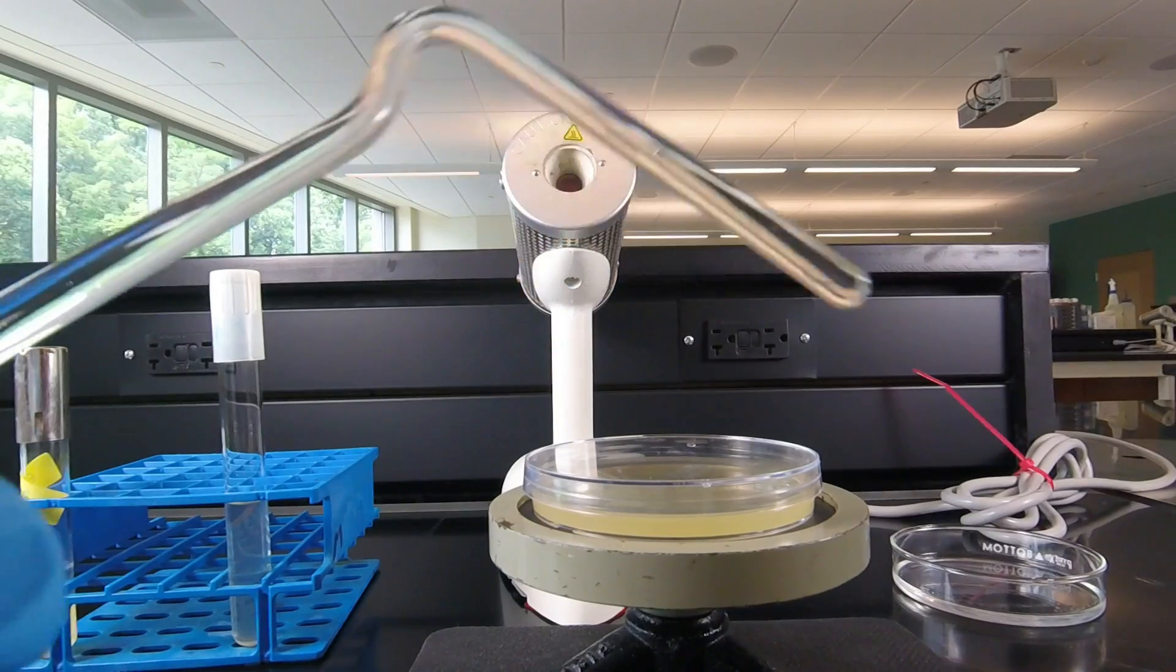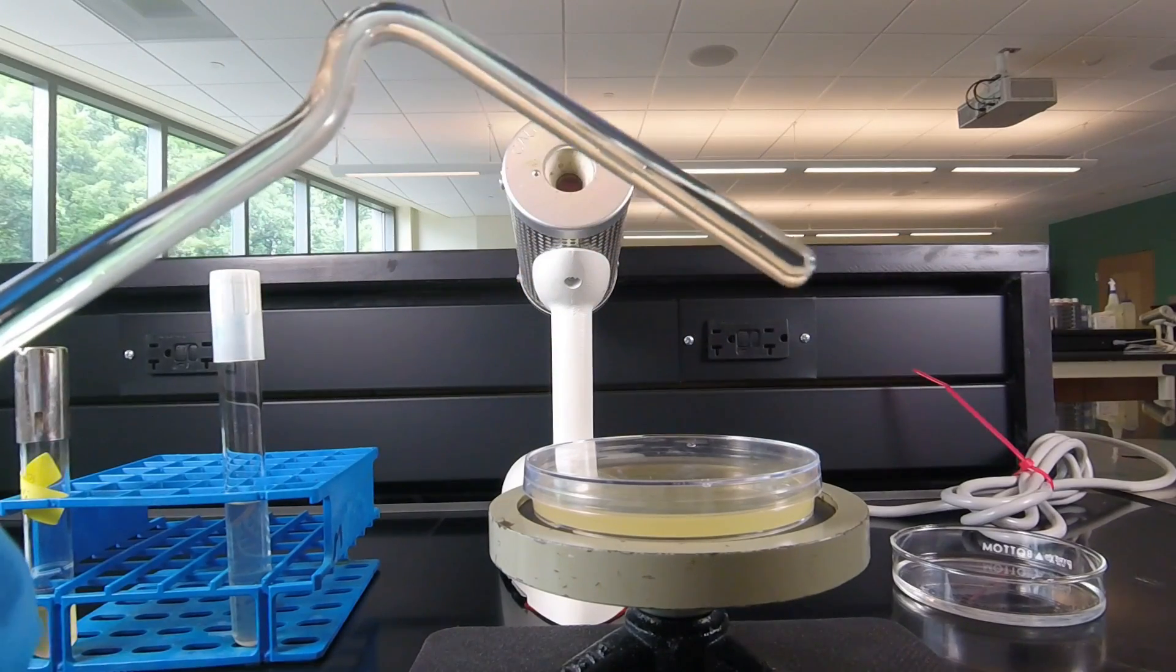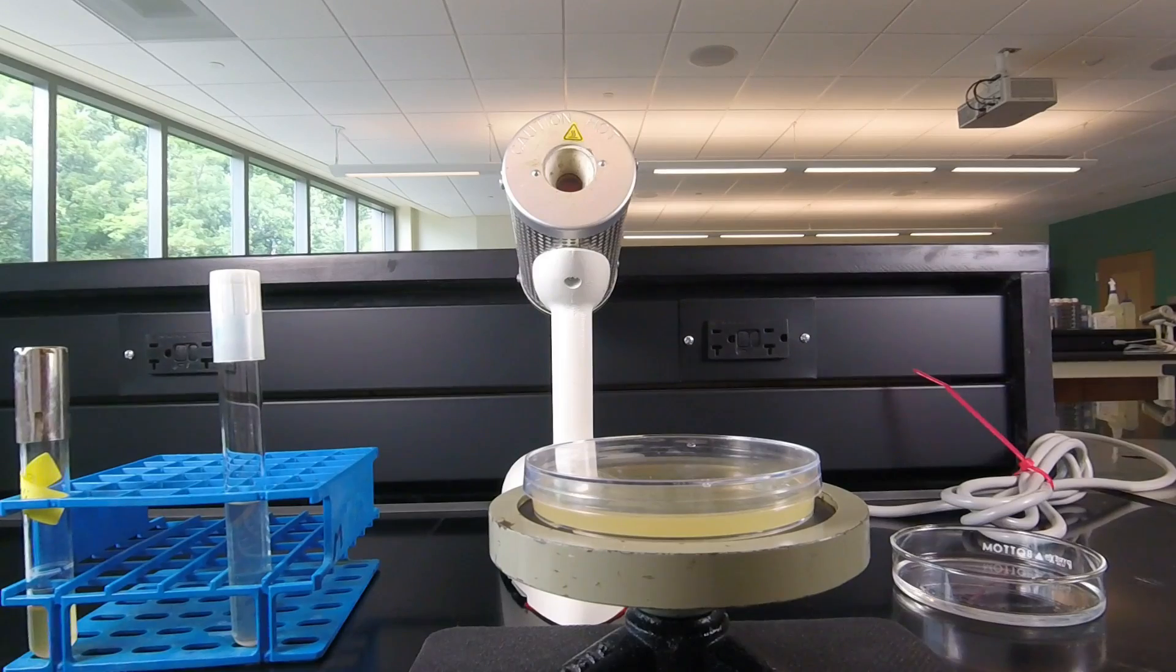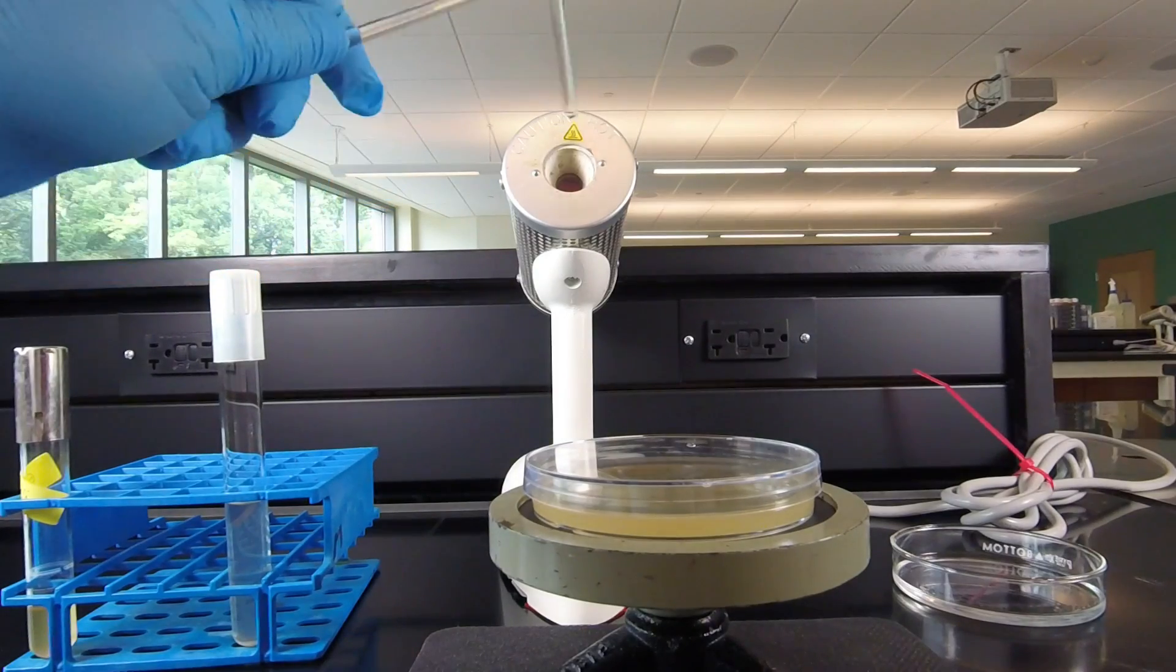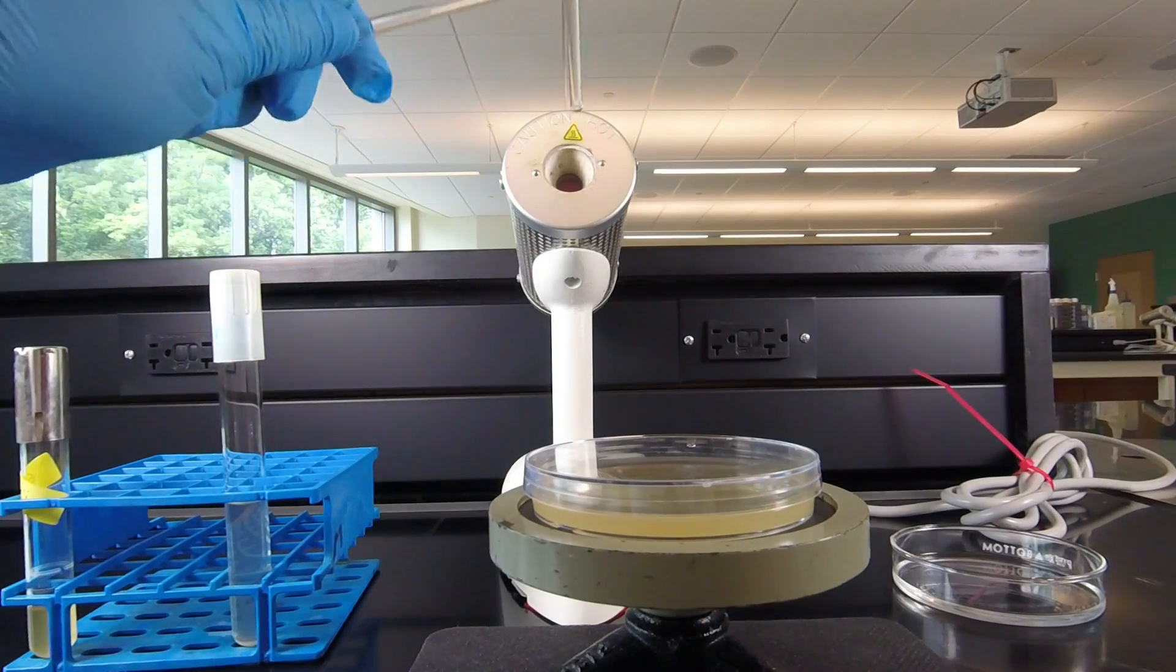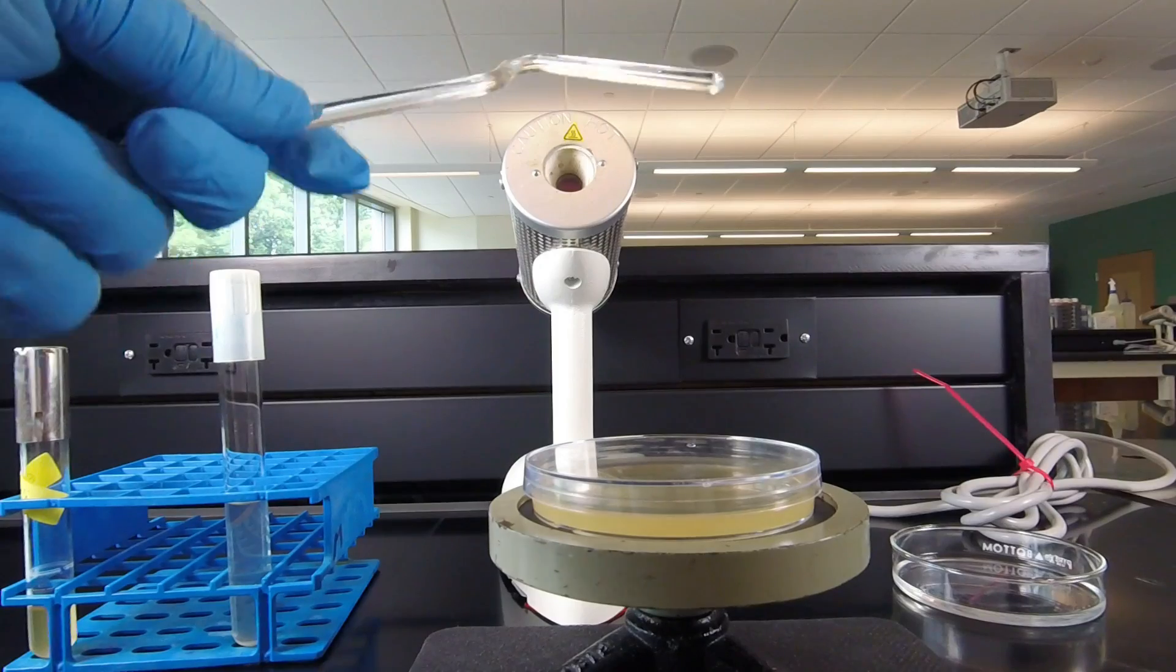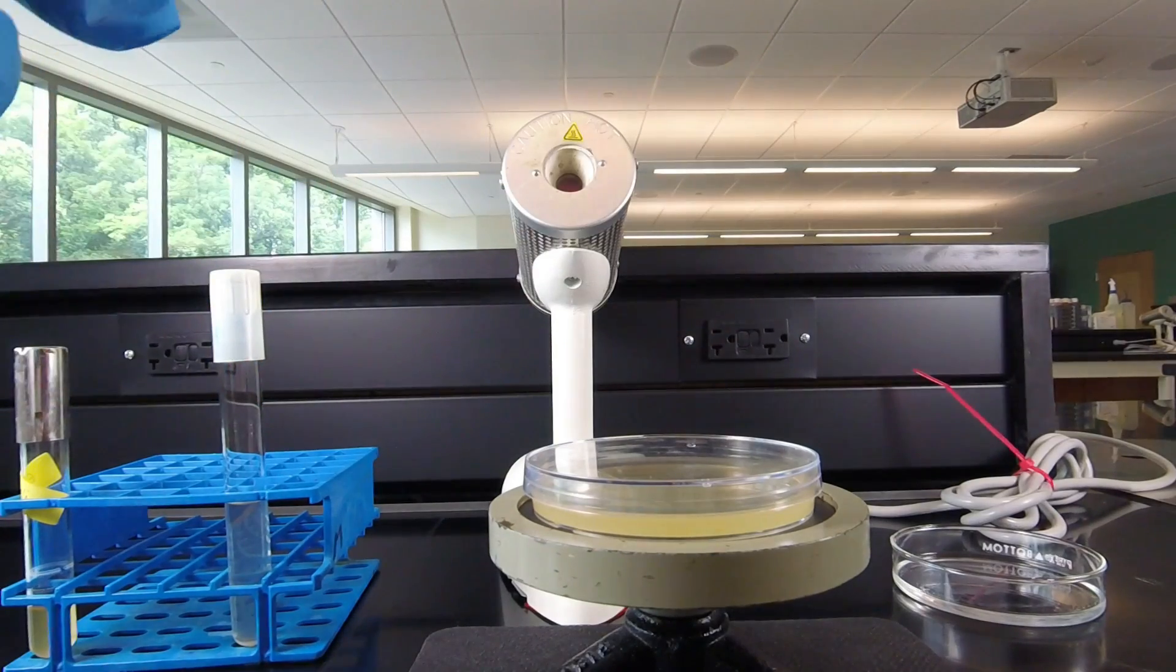Now as I mentioned to do this we're going to use a bent glass rod but of course the glass rod is contaminated since it's been sitting on the bench top. So what we're going to do to sterilize it is not use the Bacto incinerator because that would heat the glass and glass holds the heat and that would kill the bacteria when we tried to spread them.